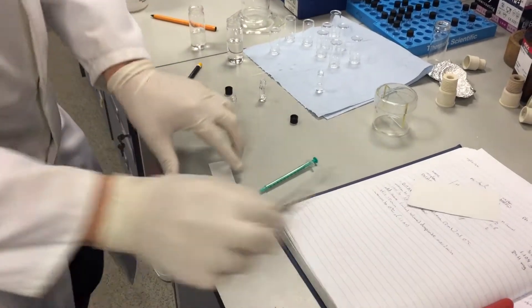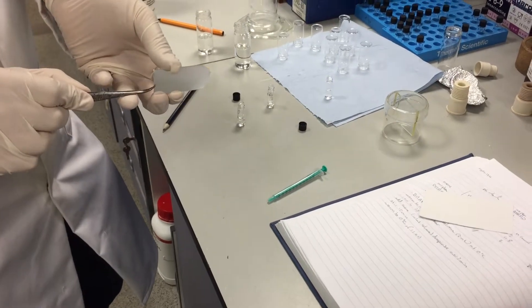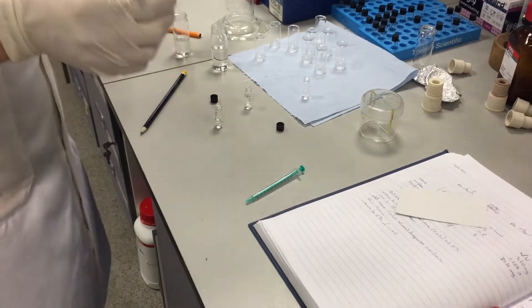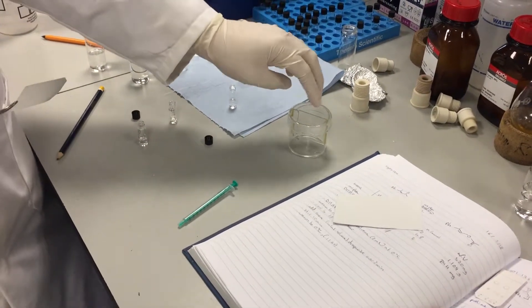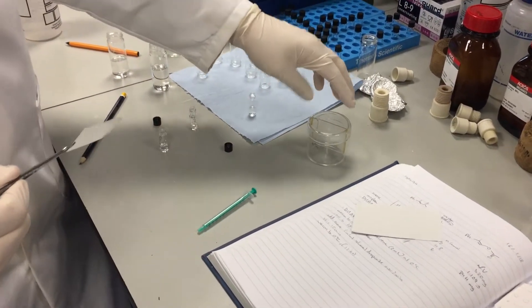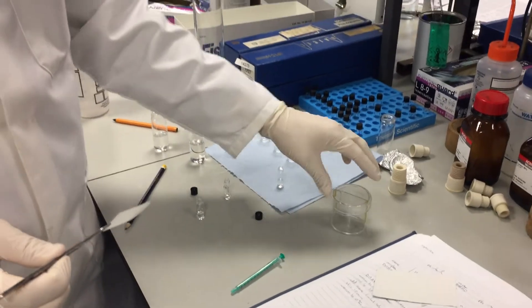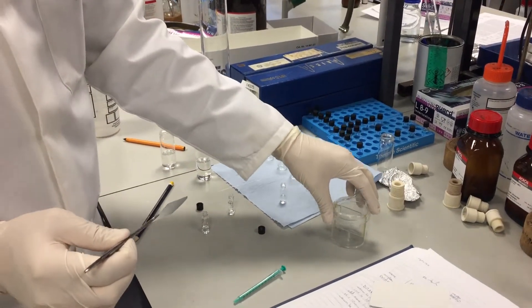We then take the TLC plate and put it into a TLC compartment. So here I've got an appropriate solvent mixture already. In this case it's 15% ethyl acetate petroleum ether and this will depend on every reaction that you do.